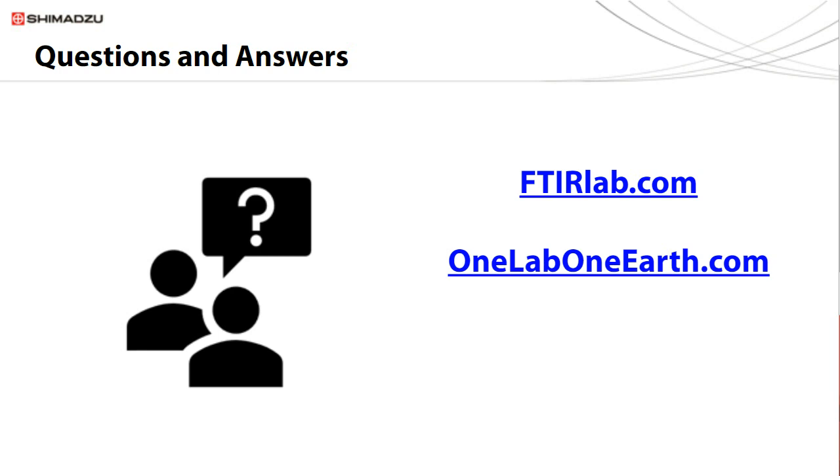So just to summarize, it might be challenging from the beginning. You might think it's going to be difficult, but at the end, the operation of the instrument is less complex than other instruments commonly used in environmental labs. So don't be afraid and start working on microplastics analysis.